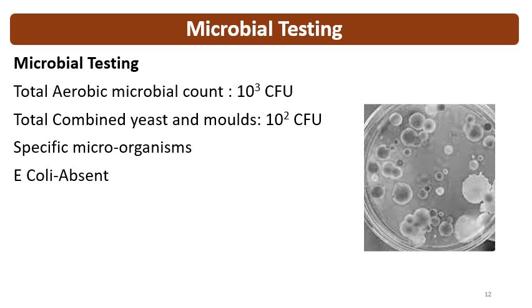And the last is microbial testing. For tablet formulation, microbial testing generally doesn't pose more challenges, but certainly it is a very important test. For solid oral formulations, microbial testing is done, and in microbial testing, the total aerobic microbial count limit is 10 to the power 3 CFU, that is colony forming units. Then total combined yeast and molds. Then specific microorganisms include E. coli. This E. coli should be absent.